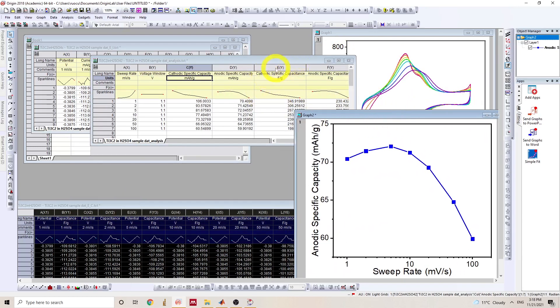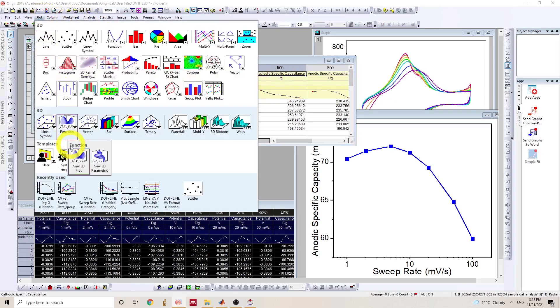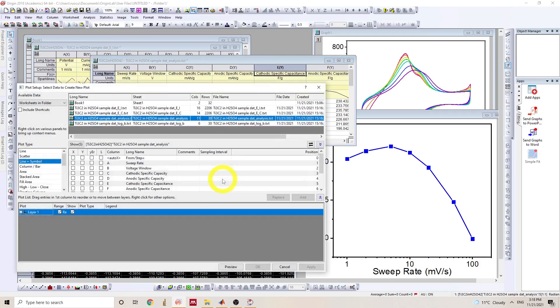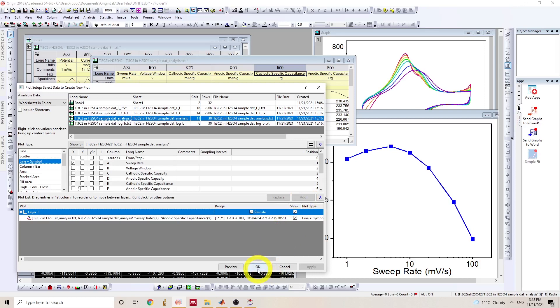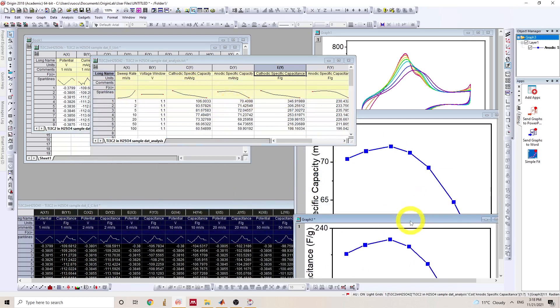And you can do a similar thing to other data depending on what you like. So we can pick like sweep rate versus the specific capacitance. Then you will have another file. All right.